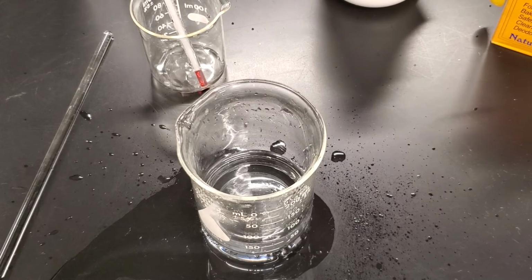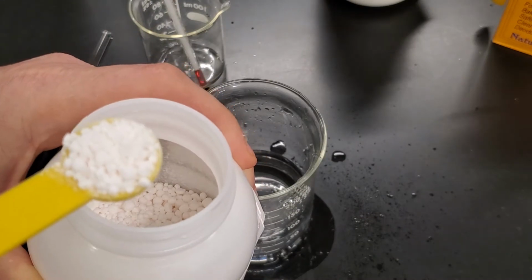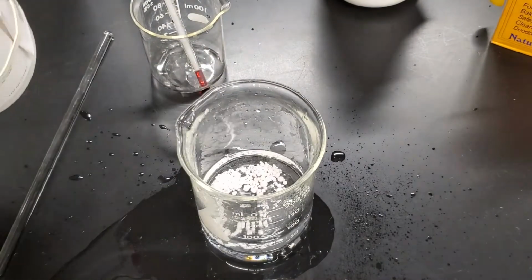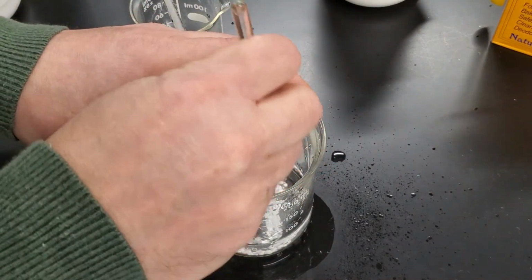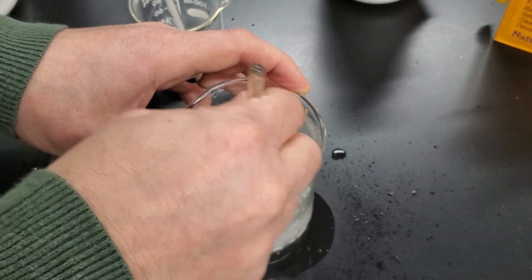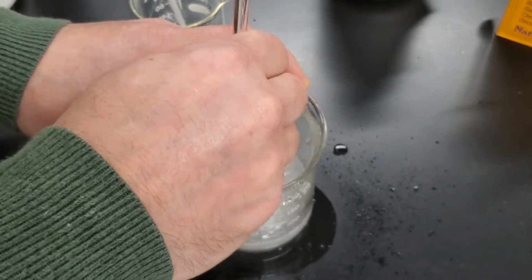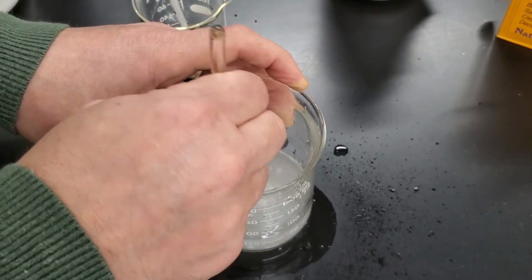However, calcium chloride, I'll show you here, it comes in these little, they're almost like little BBs or pellet type shapes. So it's going to take a little extra effort to get that to mix in. We'll actually probably have to crush it just a little bit to get some of those into more of a powder form. Try to stir it around really well. Try to get this to dissolve as much as possible. And we won't get all of it to dissolve, but we'll still be able to measure and determine if a reaction took place without all of it dissolving right away.